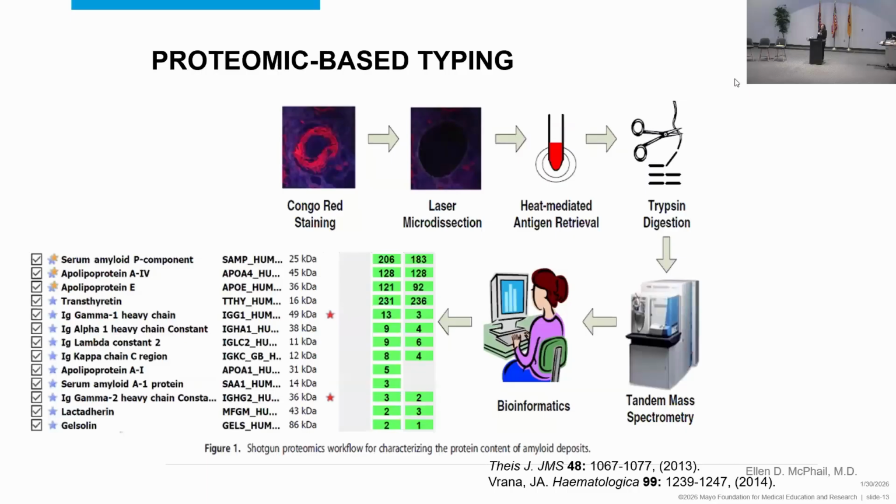And there it is. And then that's tissue that we actually analyze. So it's enriched and that enhances the analysis. This is the process. It's not too important to go through the details, but in the end, we end up with a scaffold. That's that green graph. We do every sample twice to make sure we are reproducible.